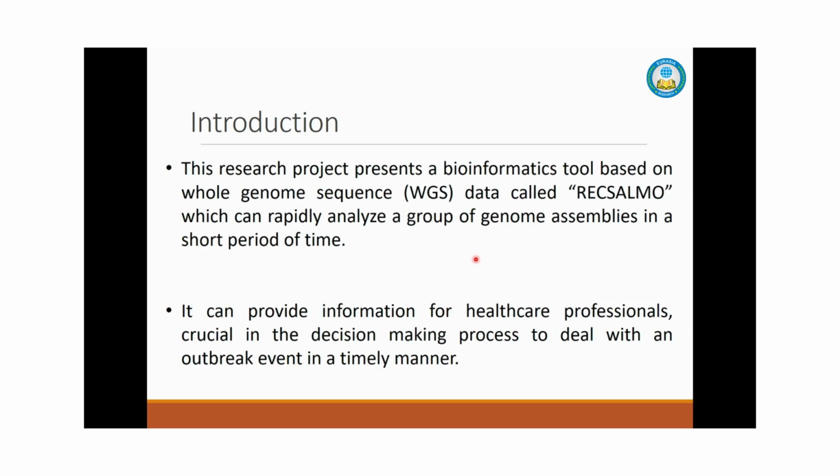They can use this tool to track the origin of the Salmonella species or serotype, then pinpoint the exact serotype and inform the related individuals in order to take action.